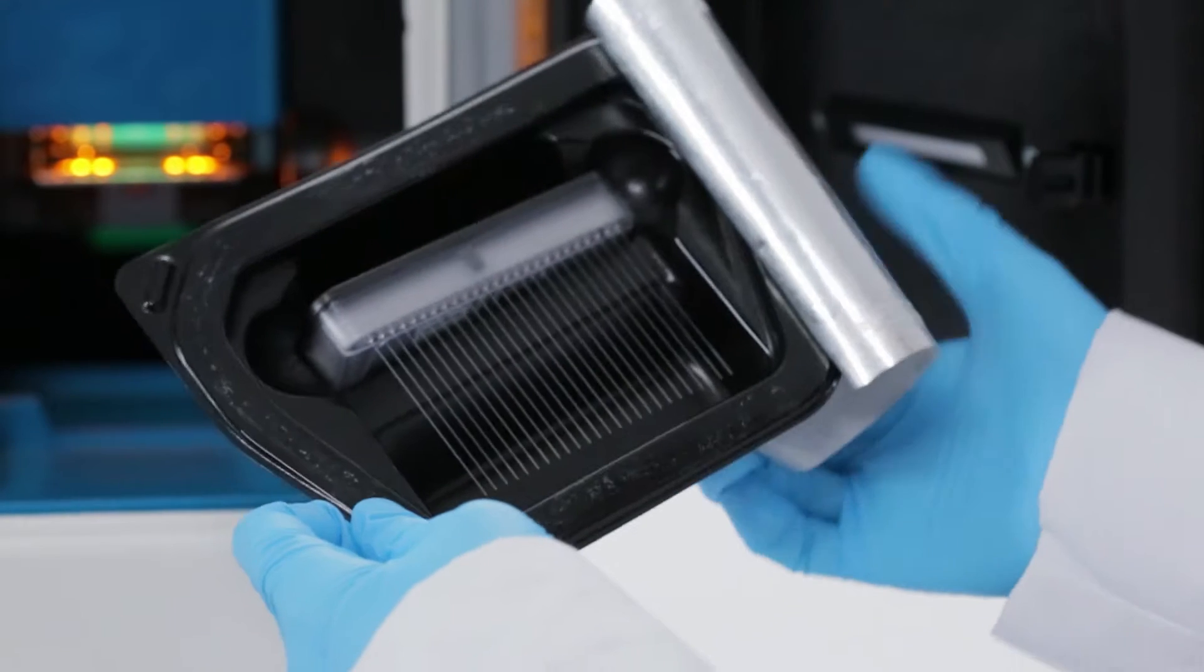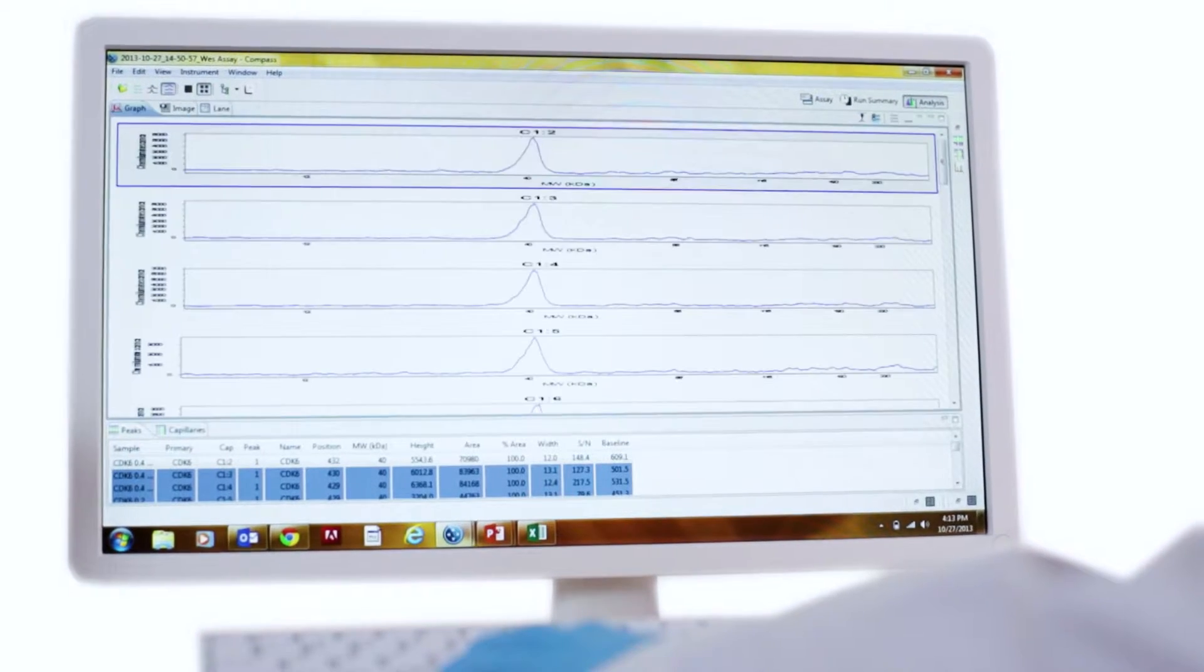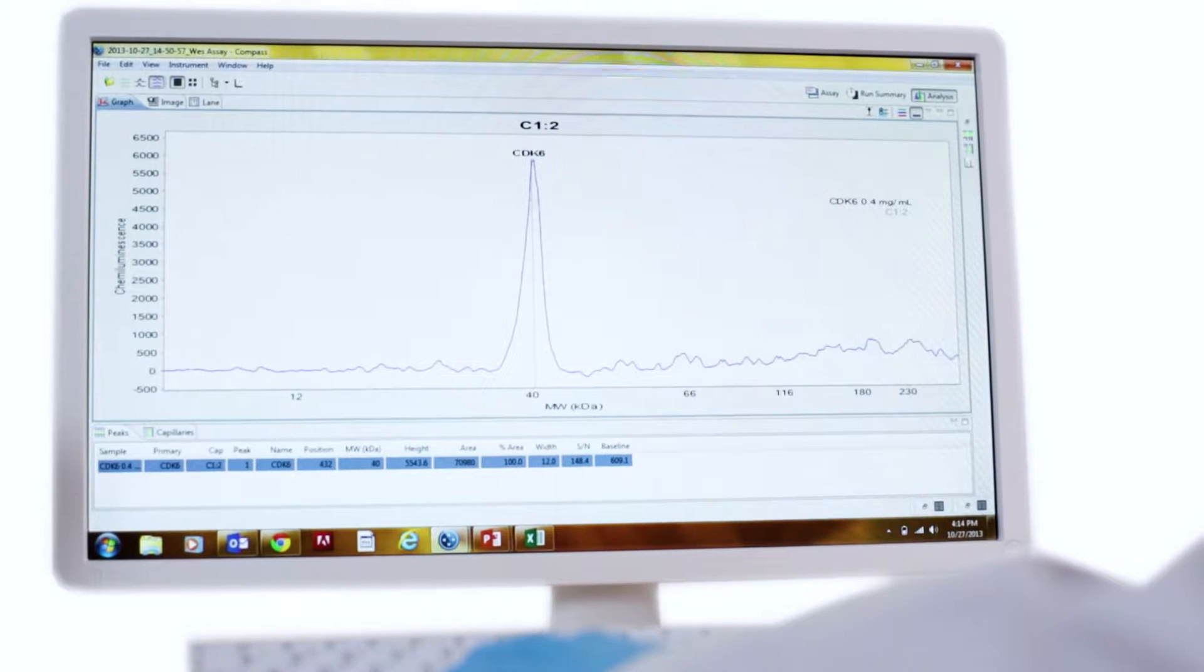Simple Western reinvents how Westerns are done, automating all steps from protein separation, immunoprobing, detection and analysis of data.